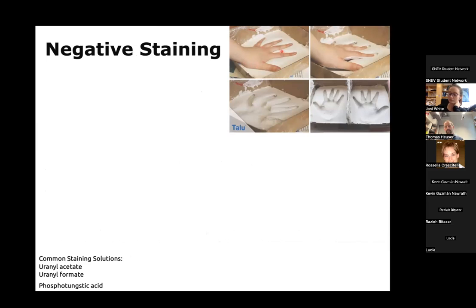So you can think of this a little bit as if you would take your hand and put it in a soft mold. This is what you see here. And then what you're visualizing in the end is not your biological sample, not your hand, but you're visualizing the imprint it left behind. If you do this sloppy, hopefully it'll still be good enough to see, okay, I have here something with 5 fingers. If you do this more carefully, you might be able to see, okay, there's a ring on this finger, or you might even be able to see the fingerprints conserved in this mold.